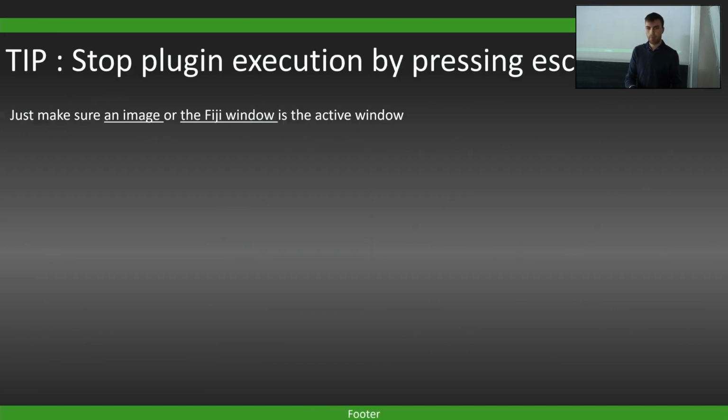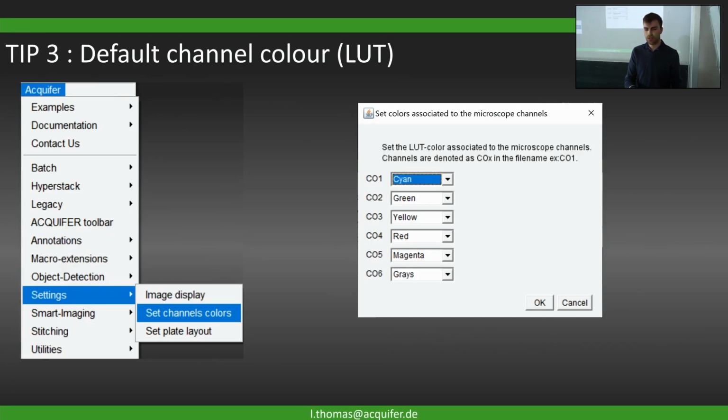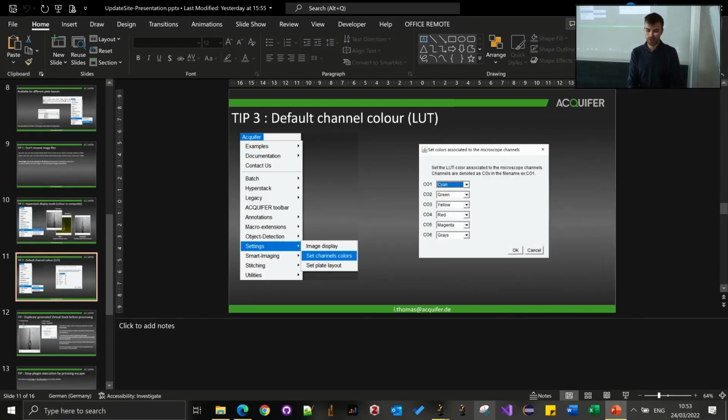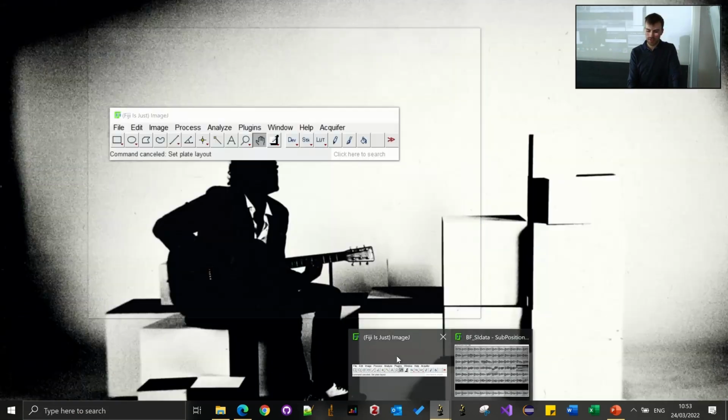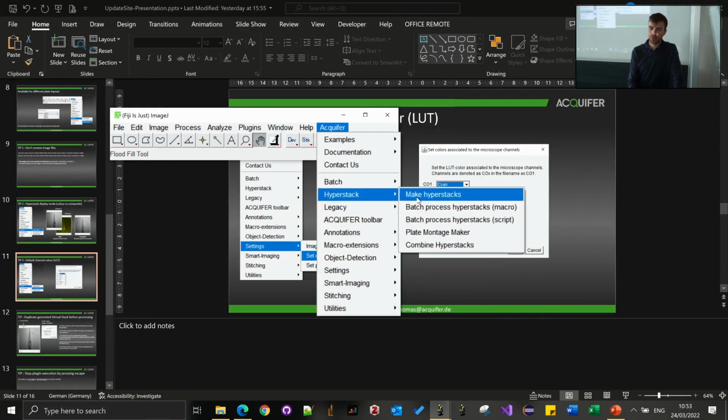Should be also possible to add a scale to all of them, right? Scale bar? Yeah. In which plugin? All of them? Yeah, or if you want to compare different, like if you have stuff that grows differently. Actually, I think the plugins should automatically set the scale, at least in the Hyperstack. So normally you don't have to do the conversion yourself, you can go directly to this add scale bar and it's going to be the good size.